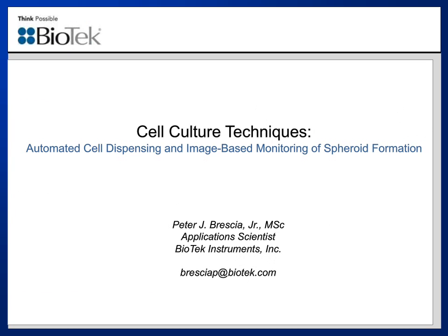I'll include a brief introduction today to 3D cell culture, as well as the instrumentation and materials used, and an application note that I'll present, and I'll describe in more detail the workflows including cell seeding, media exchanges, and automated image-based monitoring. Any additional information regarding the instrument specification and methods not covered in the presentation can be found by following the links included in the presentation resources section, or they're also available at biotek.com.